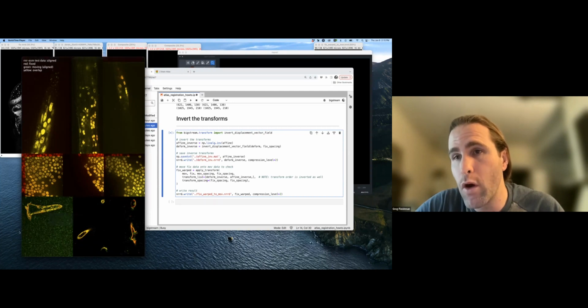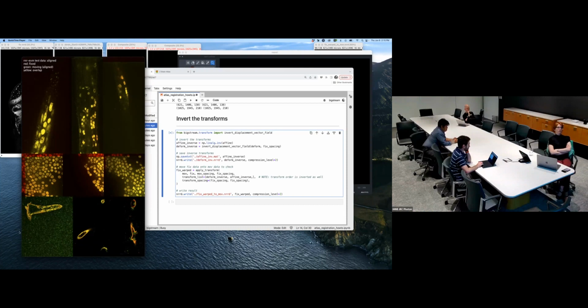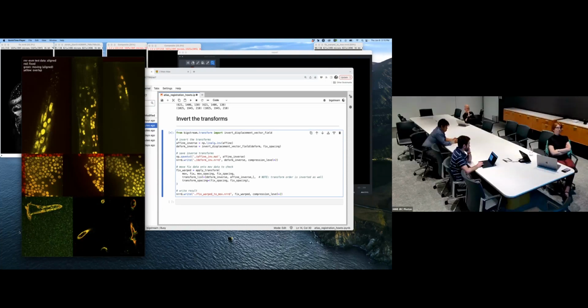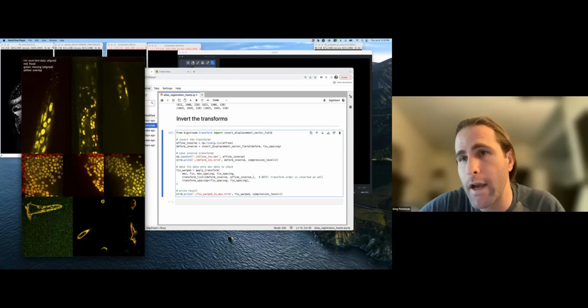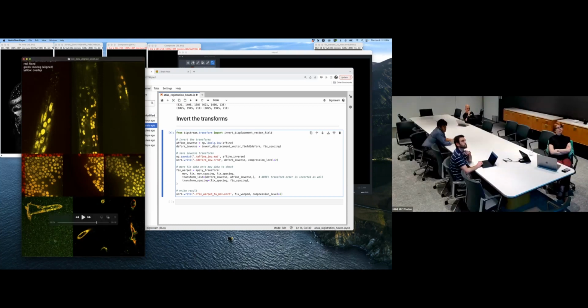If you start with a big warp just to get the two objects right on top of each other, or get out some of the really tricky to deal with distortion, then an automated one might work very well after that. Conversely, if you do a nice, gentle, rigid automated alignment that works well, maybe a manual alignment after that is really less time consuming because the correct corresponding objects are much more apparent when you're looking at the two images.